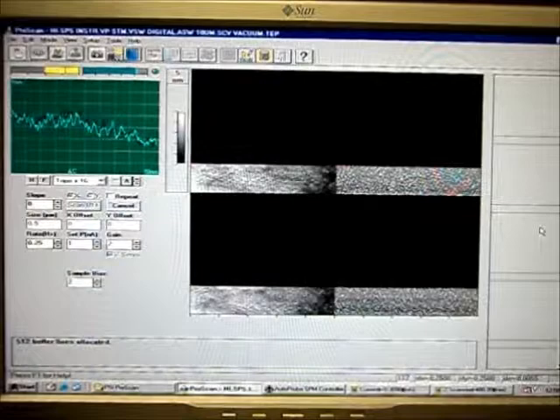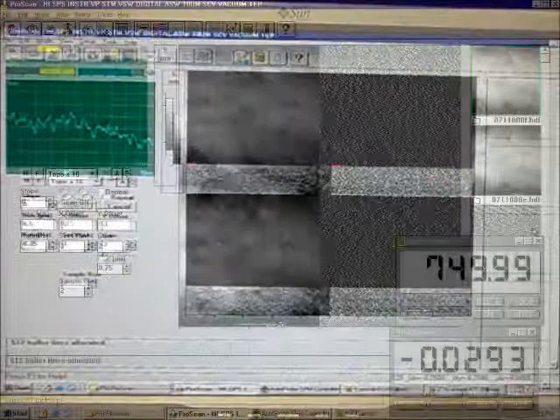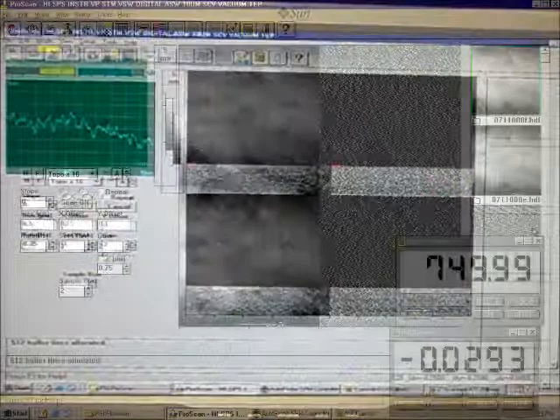This is a scan of gallium arsenide with indium islands. We would expect to see the indium islands as white dots in the topography since they are elevated, and also white in the conductance mapping since it has a higher conductance. The parameters are on the left for adjusting the X and Y offset, size of the scan, the current, voltage, and the scan rate.